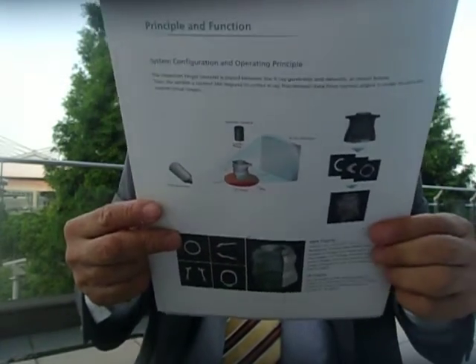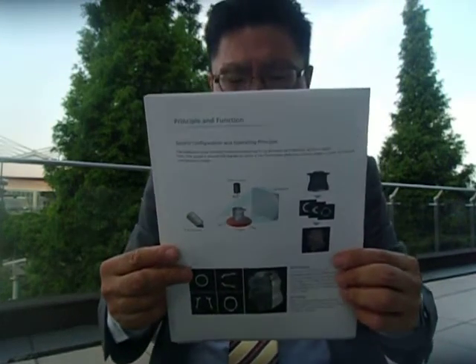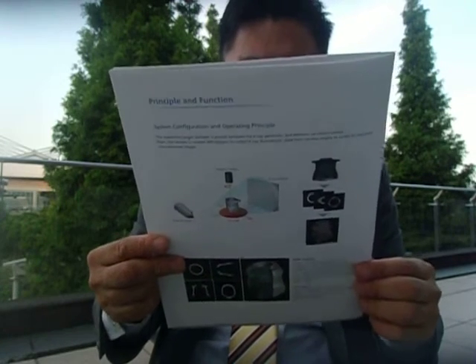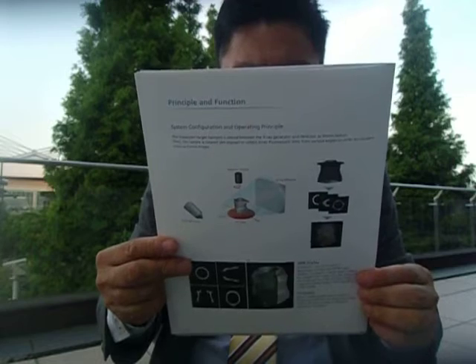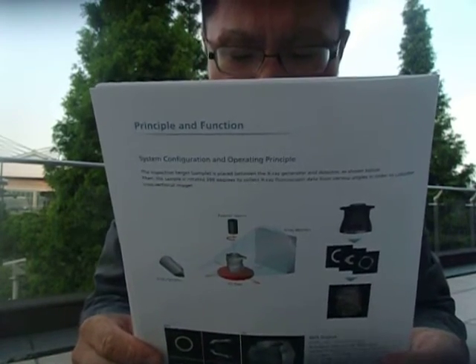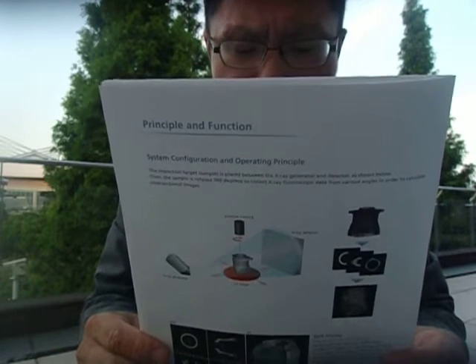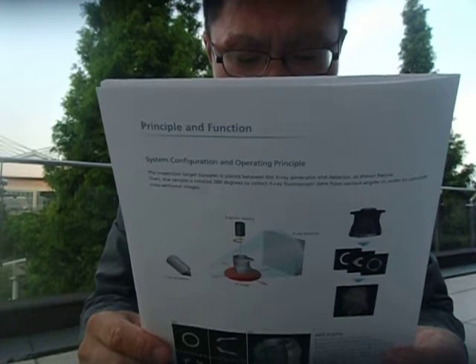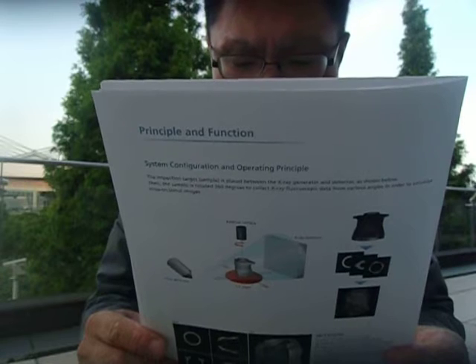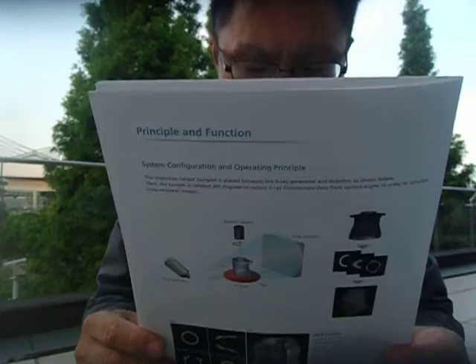Finger prevention mechanism. A finger prevention mechanism provides accident prevention when closing the cylinder door. Collision sensor. Collision sensors are provided along the X-ray tube to stop the CT stage in the event of emergency contact with the sample. The collision sensor window can be opened or closed depending on the magnification rate.